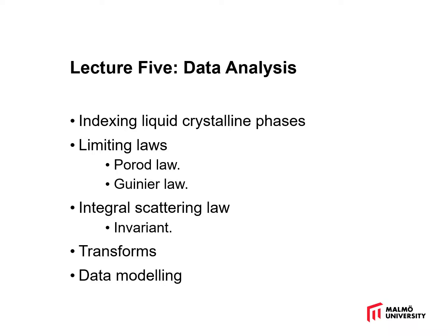In this lecture, we're going to be talking about data analysis, how to get to structural information from the scattering curve. In the first case, I'll be looking at some very specific structural analysis. That is the indexing of liquid crystalline phases. This is very specific, and I'll take a few slides to do that, but quite useful.